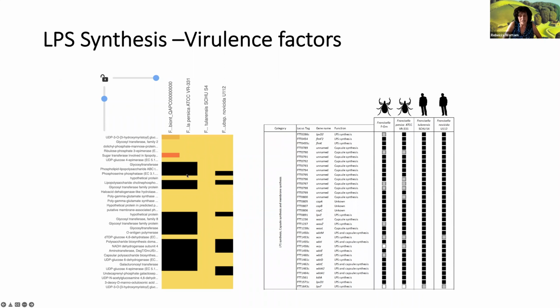And so you can see sort of similar results, mainly that these guys had basically everything as these guys did. I didn't do a complete deep dive into what was going on here, but it's something I certainly could. You can see they have a lot of pseudogenes mentioned as present and absent, and some things that are completely missing, which we had as well.